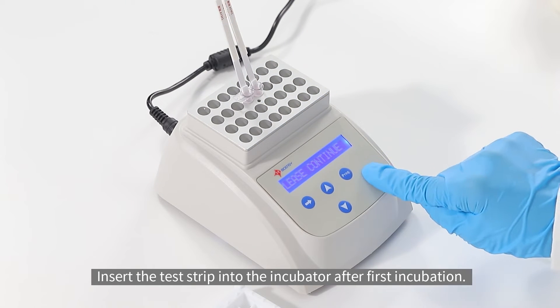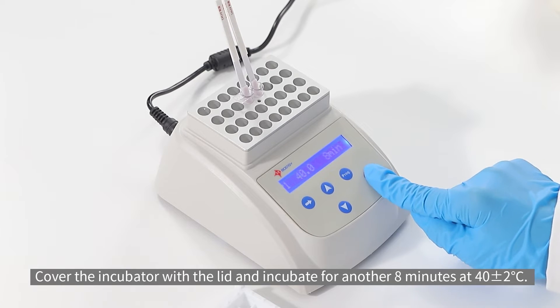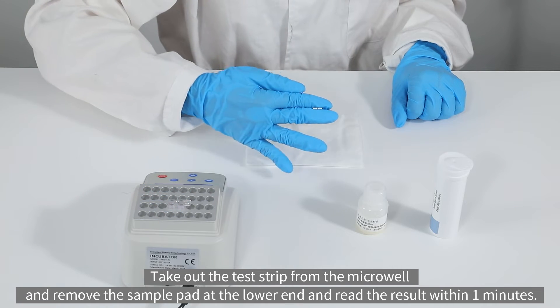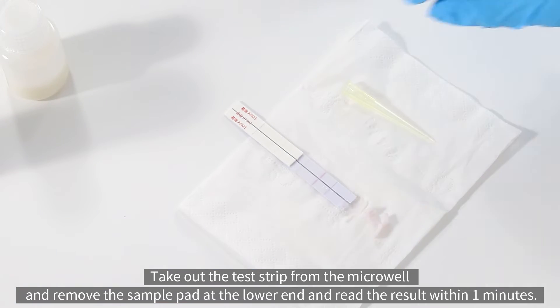Cover the incubator with the lid and incubate for another eight minutes at 40 plus or minus two degrees Celsius. Take out the test strip from the micro well, remove the sample pad at the lower end, and read the result within one minute.